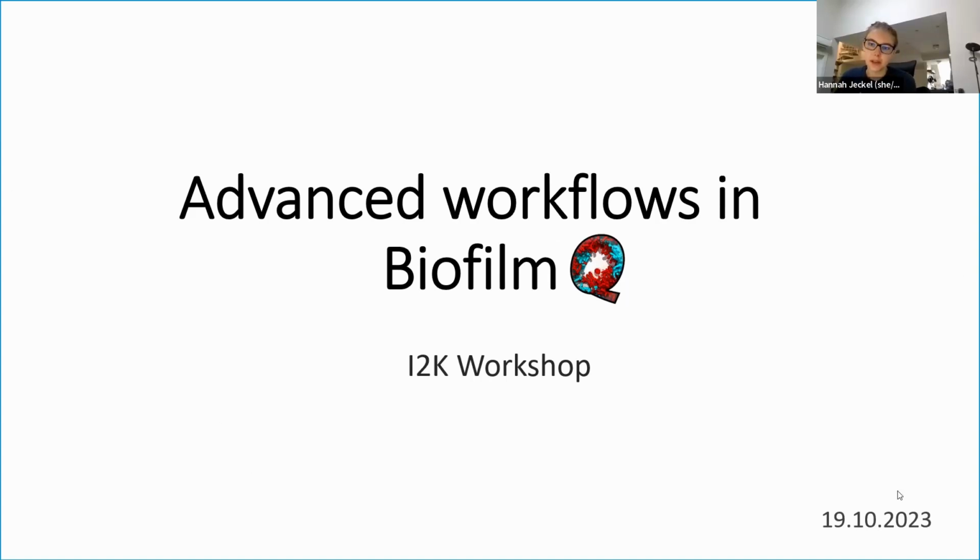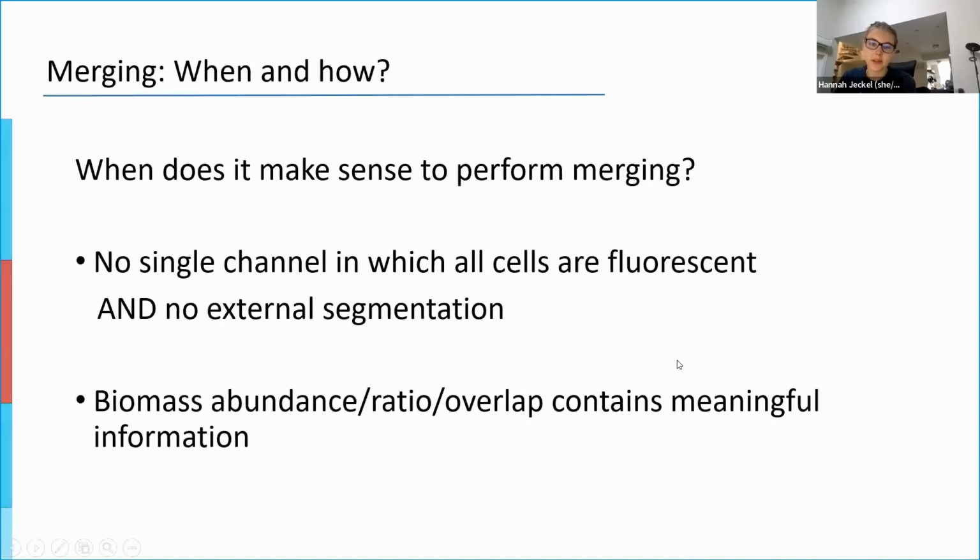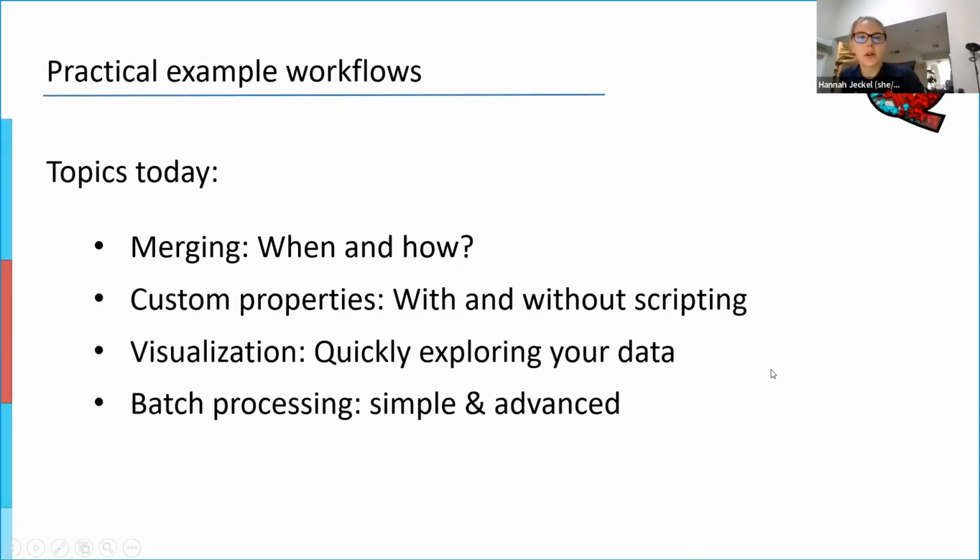So we have a few different topics, and I hope that we can get through all of them today. The first one is that I want to talk a little bit more about merging. So merging is something that was discussed in one or two previous workshops, I think already. So there is something on YouTube that you could watch to also go a little bit more into depth beyond what we're going to do today. But what I found is that it's a method that not a lot of people use when they use BiofilmQ. It's sort of a little bit hidden, but it's quite useful for different purposes. So we are going to talk about that today.